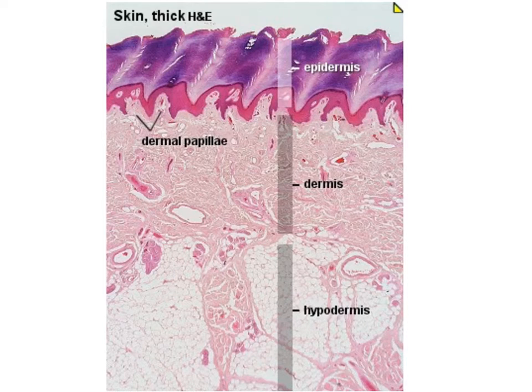As we review over this slide, one of the things that we will see is the three layers of the integumentary system. Now the first layer that we will review over is right in here. This is the epidermis. Early on in the semester, you learn this as the stratified squamous epithelium. That is the type of tissue that makes this up. And then moving down from this pink all the way down to here, we have the dermis. Now, our epidermis is composed of 5 sublayers called strata, and our dermis is composed of 2 sublayers.